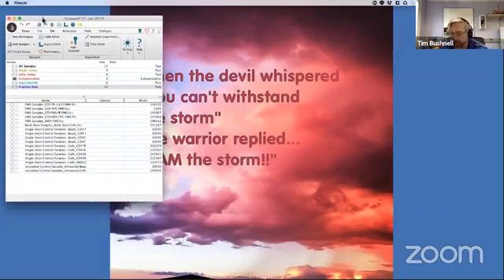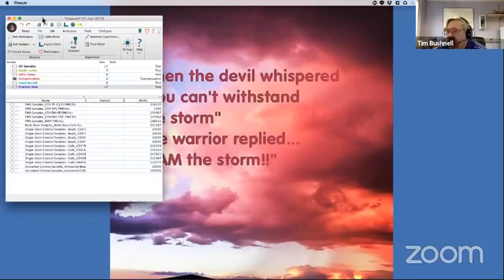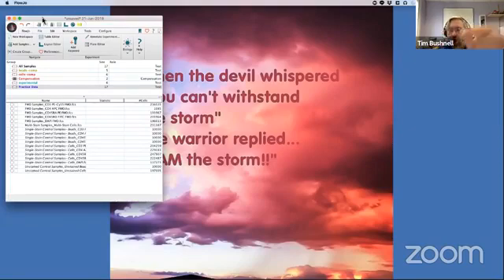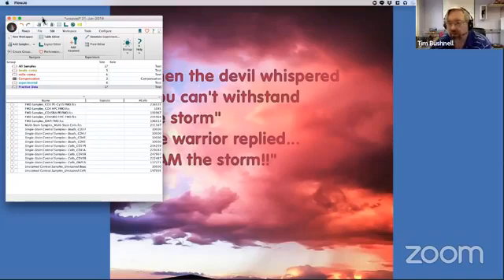Hello, and good afternoon or morning, depending on where you are. Today, I wanted to talk about compensation and show you how you compensate in FlowJo. This is following up on our discussions of last week, where we just talked about the three rules of compensation.